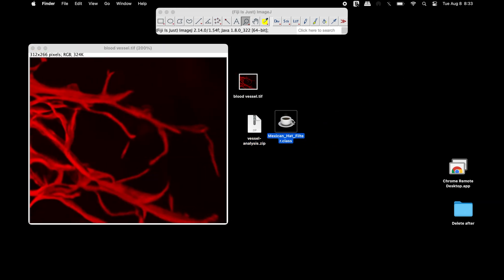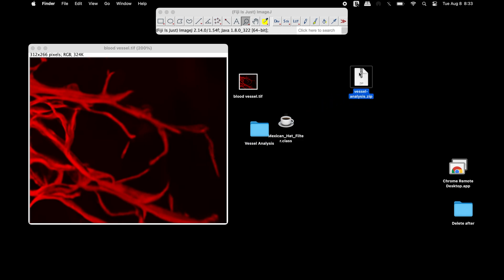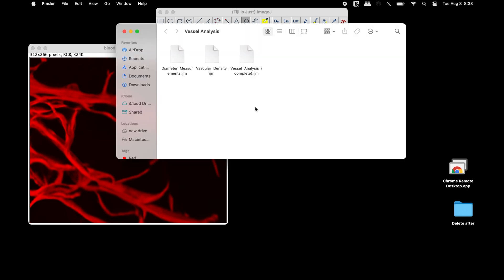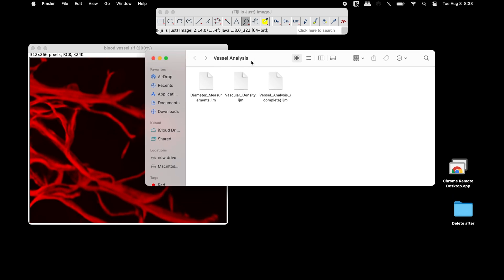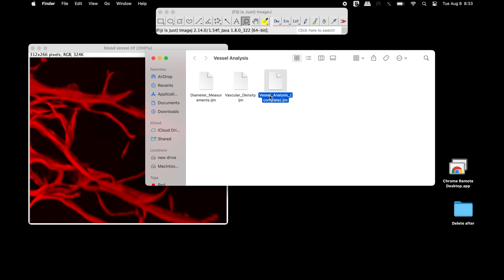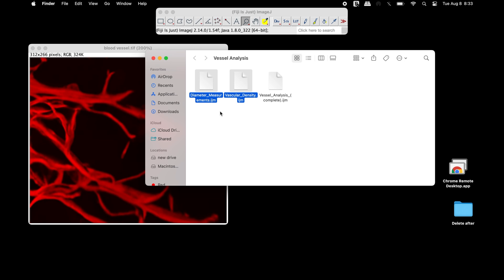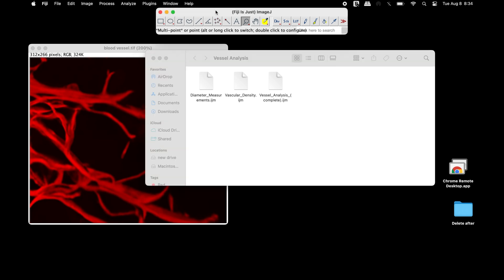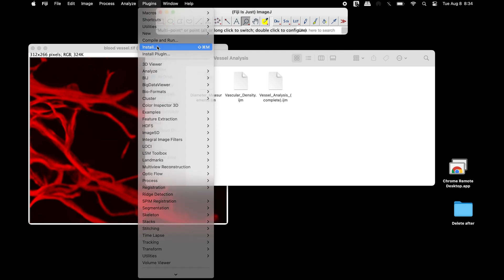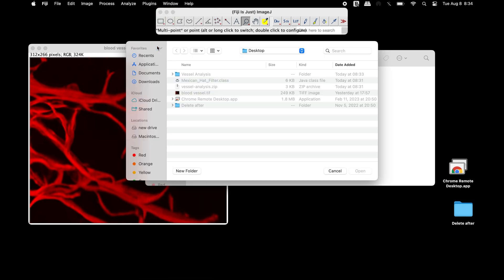Now proceed with plugin installation. Extract the vessel analysis zip file using suitable software. In the vessel analysis folder, three plugins can be found: diameter measurements, vascular density, and vessel analysis containing the complete package. Users have the choice to install the complete package or the individual plugins.